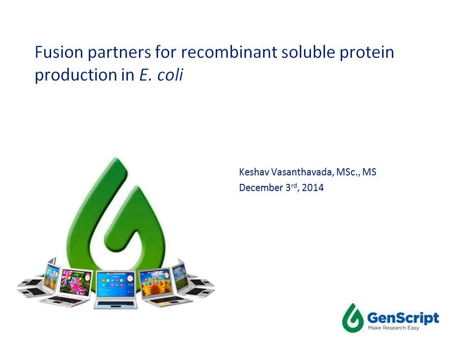So in today's webinar, I'm going to discuss a fusion partner strategy for the production of soluble proteins in E. coli. So while there are various ways to optimize expression, fusion partner based approach can be really useful. So in this webinar, I'll try to review the practical aspects of a fusion partner strategy. And in doing so, we leverage the collective experience of our production team that has generated over 5,300 batches of really high quality pure recombinant protein so far. And so I really hope that this session will help you build a better E. coli expression strategy while avoiding some common pitfalls in your experimental design.